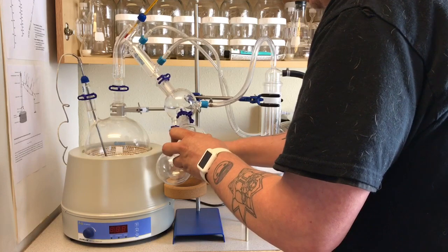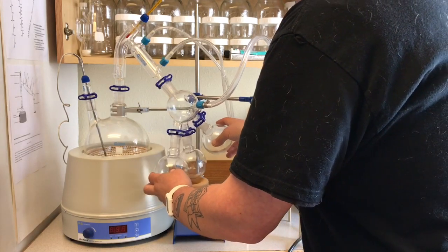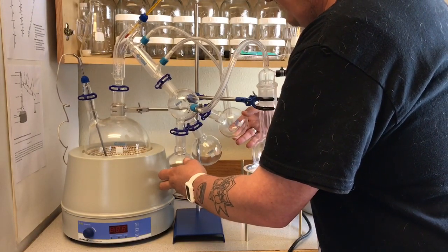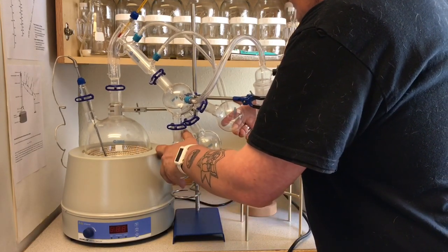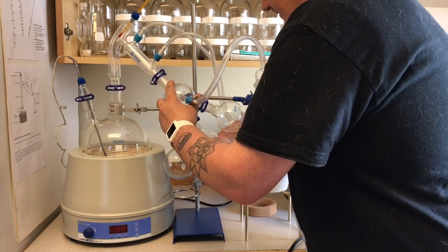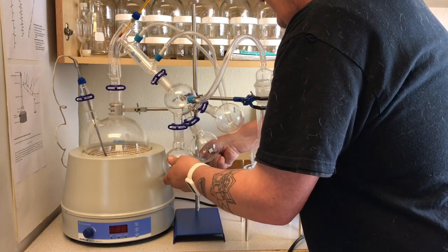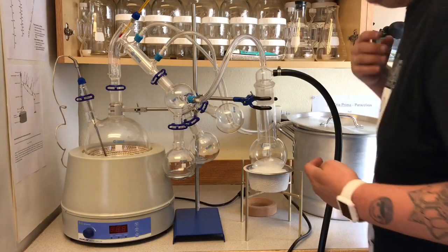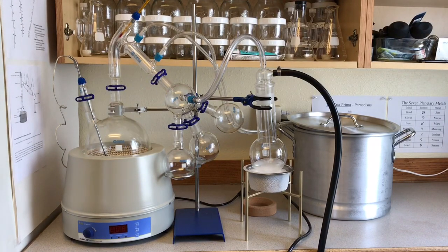So we're going to begin with this first ball here, and we just want to make sure that it's got a free swing so that throughout our process here we can swing this back and forth as need be. So we get this guy up here, and nice and straight. And I'll loosen this one. I'll bring this guy up, and this will be our collection flask for our heads for the beginning of our material. This will be our body, and this will be our tails, just like distilling alcohol. There's a head, a body, and a tails, or a head, a mane, and a tail. So we should be all ready to go.